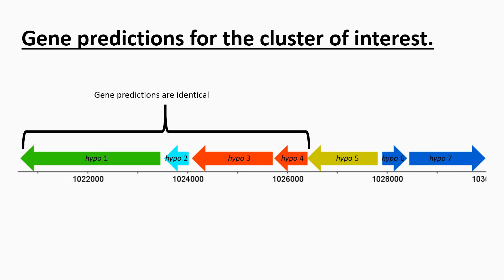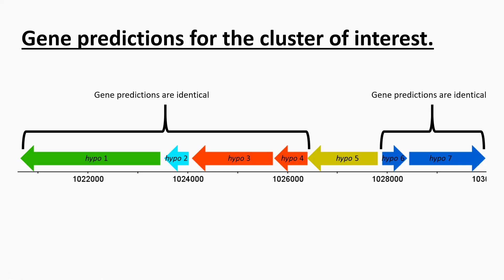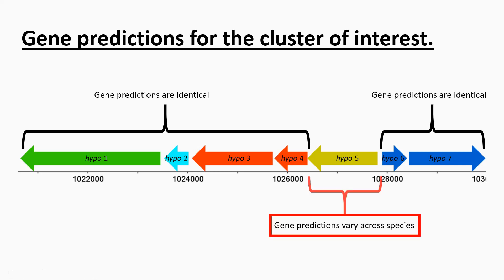When I compared across a lot of different species, I found that overall predictions for these genes are identical. So that's using RAST and Prodigal. Similarly, predictions for these are identical as well.